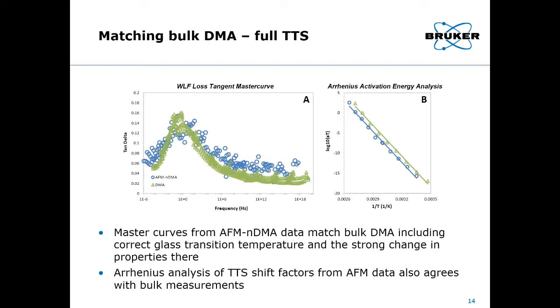Sure. So it depends a little bit on exactly what frequency you want to do the measurement at and what temperature. If you're working with higher temperatures, you typically want to have a very thin sample because your sample will take a long time to stabilize because of the stress of the sample. So if you're working with the high frequency actuator, then you also want a very small sample because of the mass of the sample. You don't want that to contribute. However, if you're working at room temperature and you're working at, say, under 300 hertz, then really you can work with most samples. It doesn't matter how big they are.